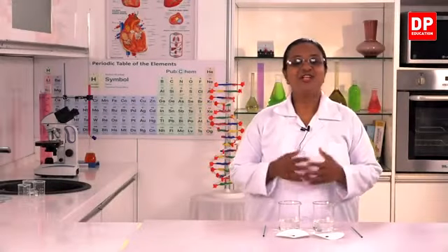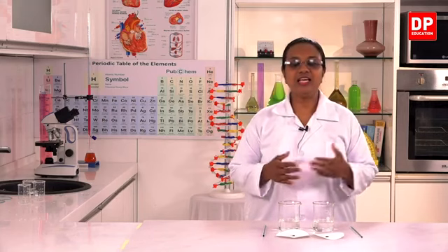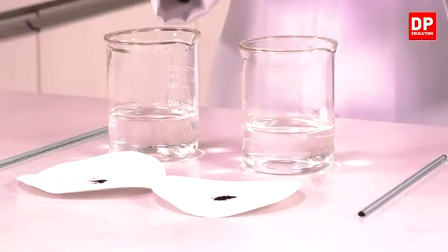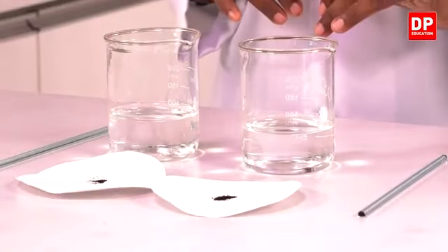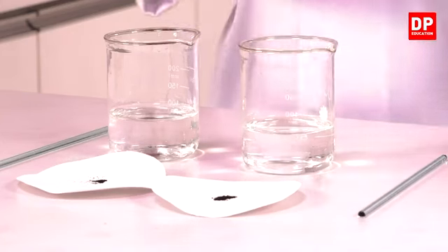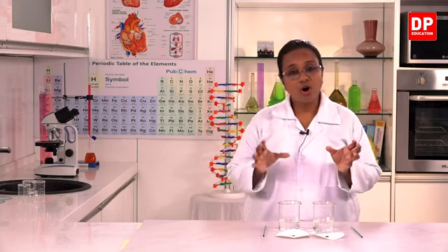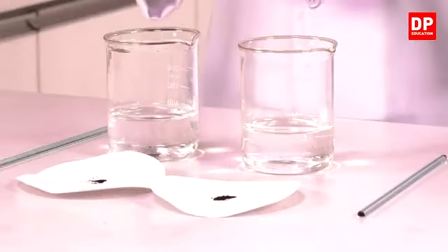Okay, students. So we are going to do this activity in order to observe the composition of mixtures. So for that, I have the same solvent and solute. I have here 100 centimeter cubes of water. Although we were supposed to take 50 centimeter cubes, in order to show you all the color change or the difference in intensity of color, I have taken more water, but in both the beakers, I have equal volume of the same solvent water.